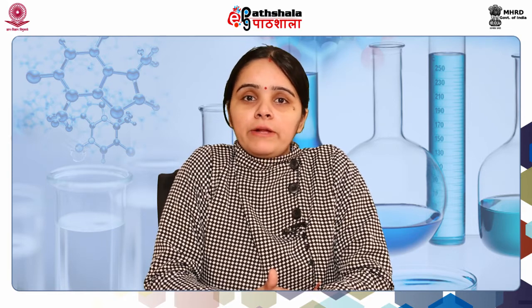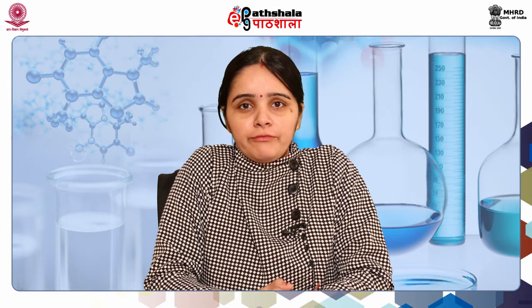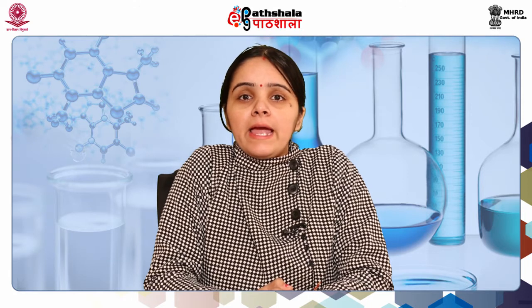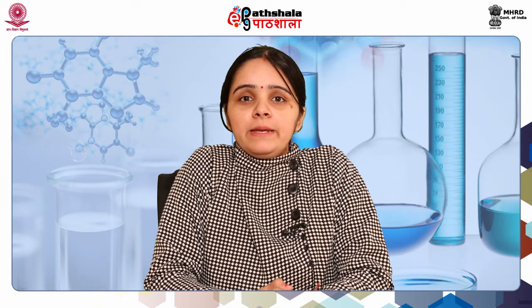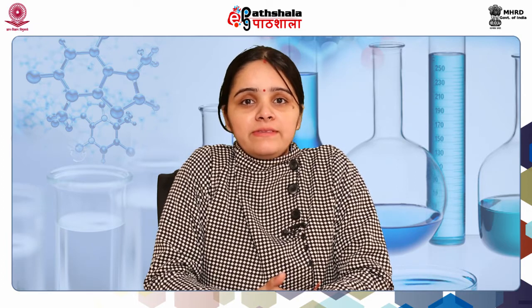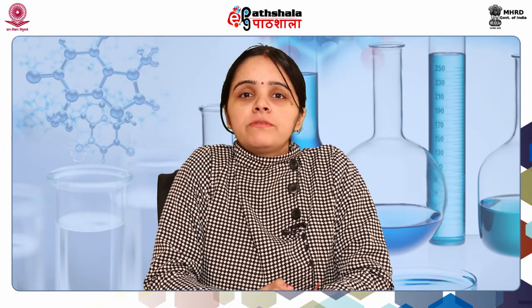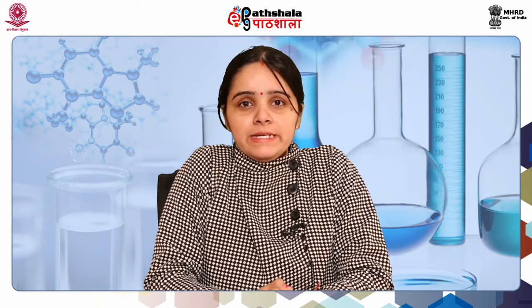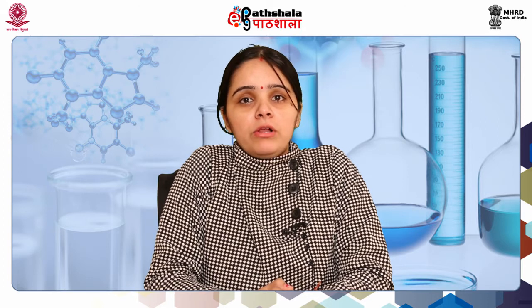Thin layer chromatography comes under the category of partition chromatography. As you all know, thin layer chromatography is a very old and efficient technique, but before it, paper chromatography was in fashion. But when TLC came into existence, it widely replaced paper chromatography because of its more robustness, more sensitivity and more reproducibility.